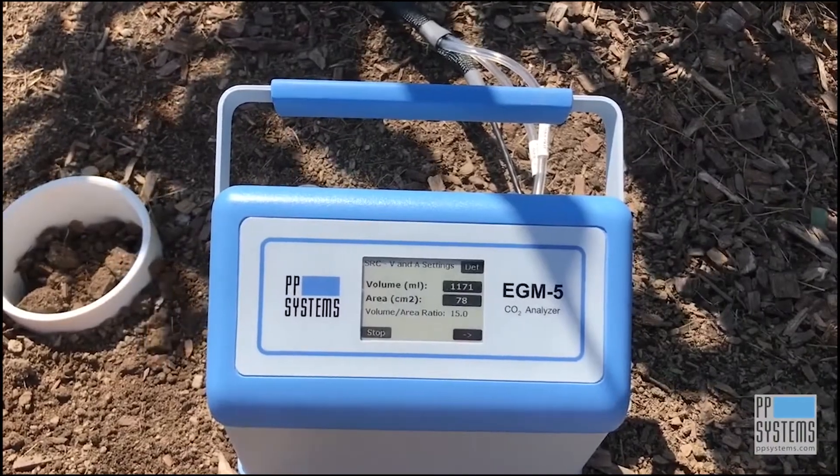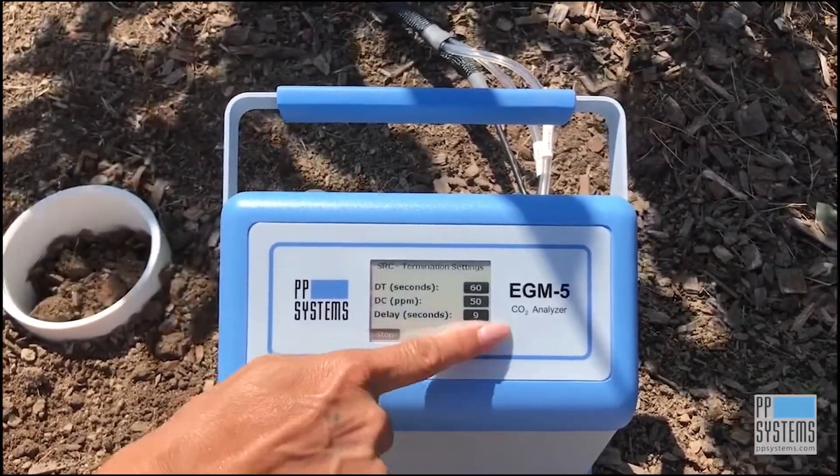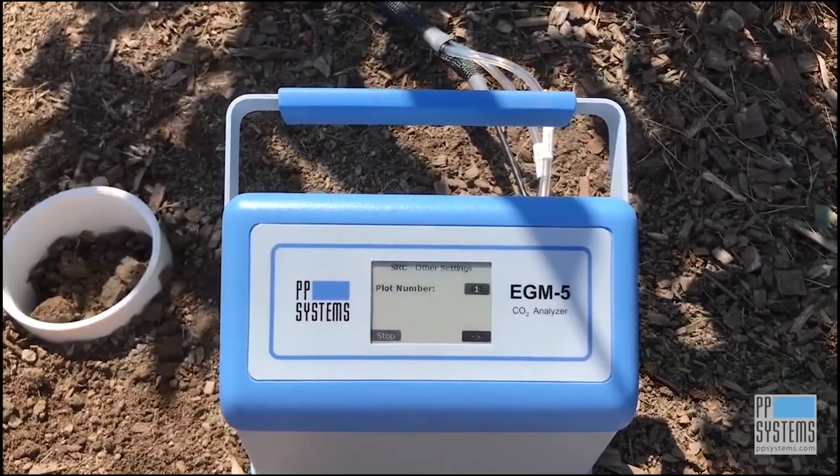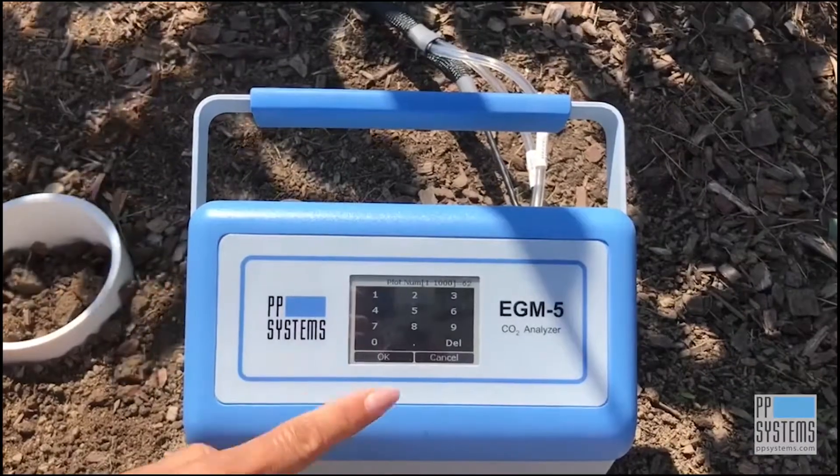The next display shows the default settings associated with the SRC-2 soil respiration chamber. Enter your plot number to identify your plot location, and after that, simply follow the instructions on the display.